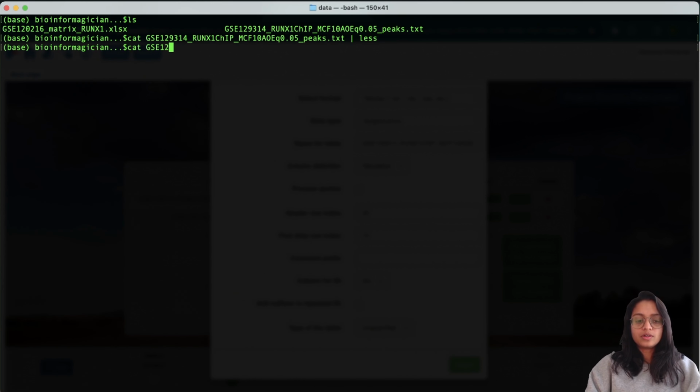We have done this previously in one of our videos, but for anyone who hasn't watched that and is watching this the first time, this is a quick way to look up what line is your header row. So the header row is 30. The first data row index is 31. For the ID, I want it to generate a unique ID, and the rest of it, I'm just going to leave as is, and I'm going to import.